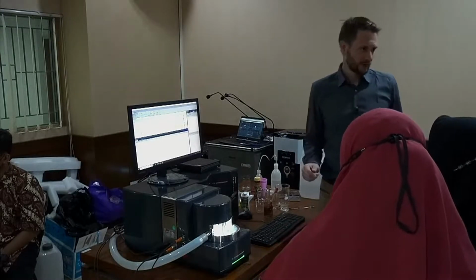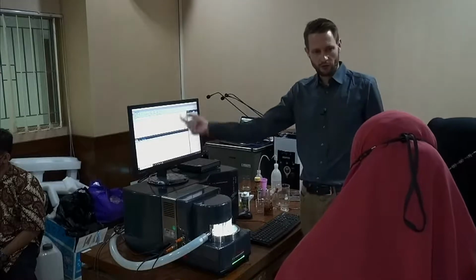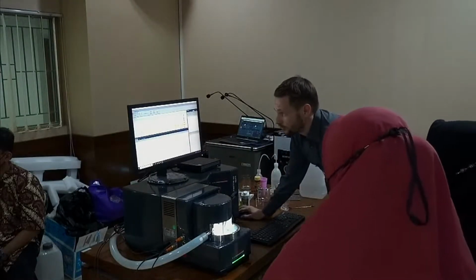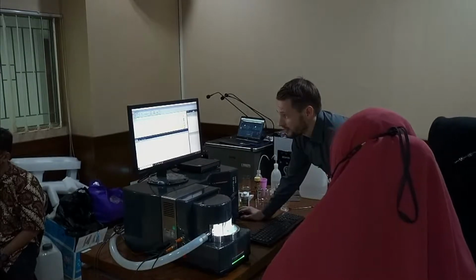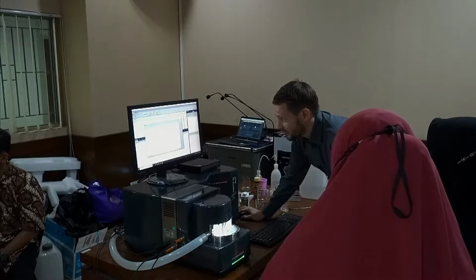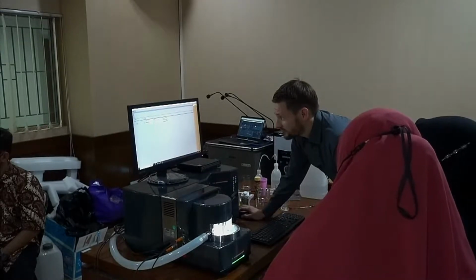So you'd think, now, okay, then let's make another measurement and use Mie. You don't have to. You can use the raw data, which we already have, and just recalculate that. So you just need to know your measurement number. That is, in our case, use 156. And now there's the SOP called recalculate. So we can now say we want to measure this with Mie instead of Fraunhofer.